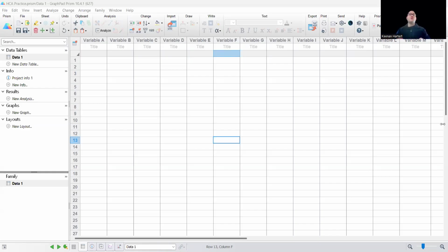So we're going to perform hierarchical clustering and visualize the cluster relationships. I'm going to walk you through dendrograms, and I use them a lot in my research too, so it's a really good tool. We're going to uncover some natural groupings for what we find there. What this is really going to help you with is when you have a big matrix of data with rows and columns and values in between, not only can heat maps graph that for you, but if you want to know who's most closely related to who, Prism has that capability now.